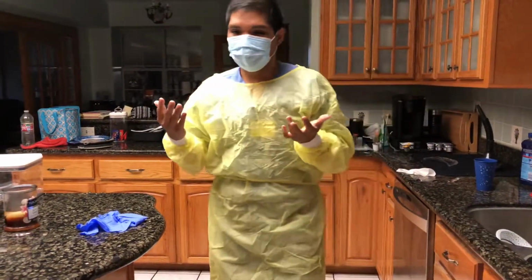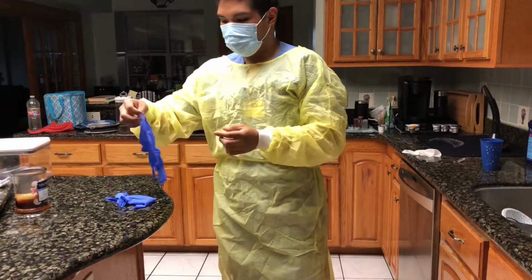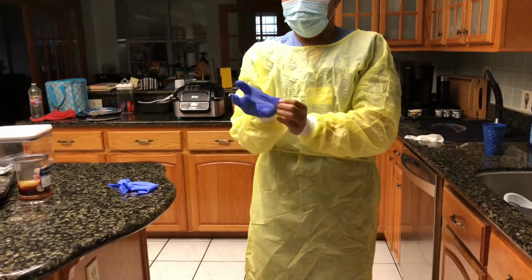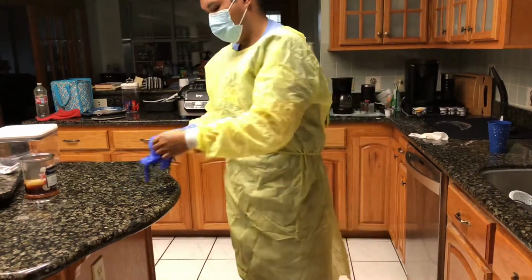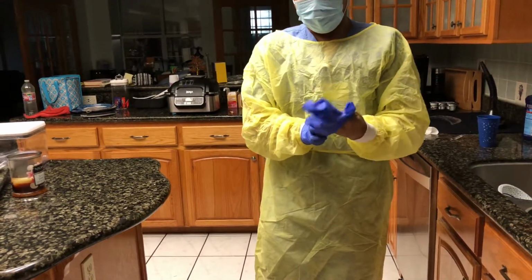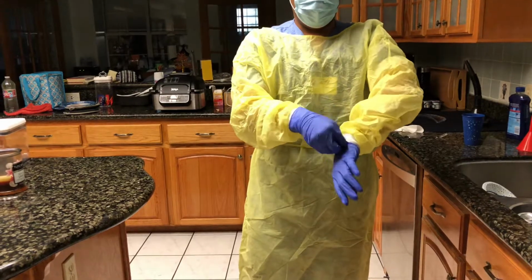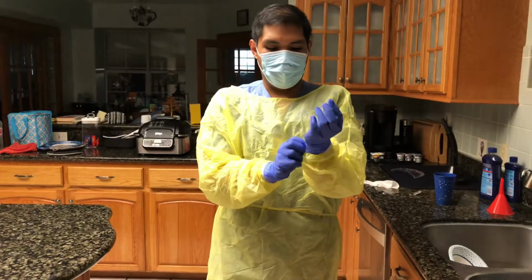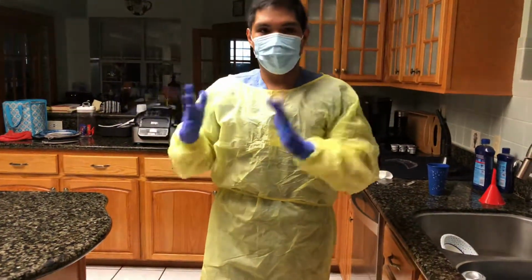Alright. Next thing you would put on is your goggles if you needed to, but right now I don't have any. The last thing we're gonna put on is the gloves. We're gonna take it one at a time. Now you have to make sure that the gloves are over the cuff of the gown. Do it on the other side. Alright. And we do all of this to prevent cross-contamination, either from the patient that you're about to do the procedure on to the next one, or the previous one to your current patient. So now that I'm all donned up, I'm ready to do the procedure.